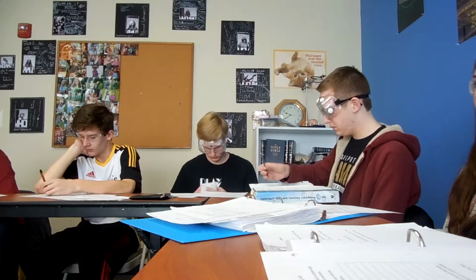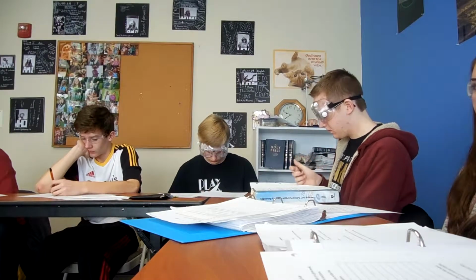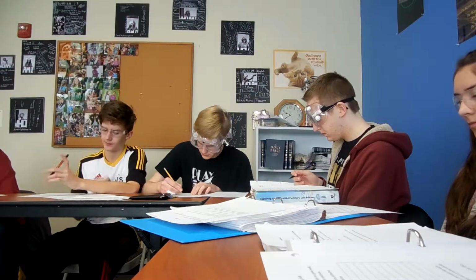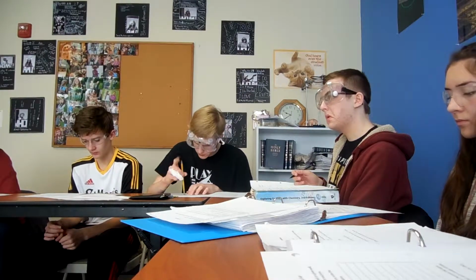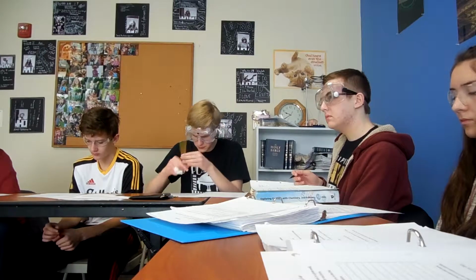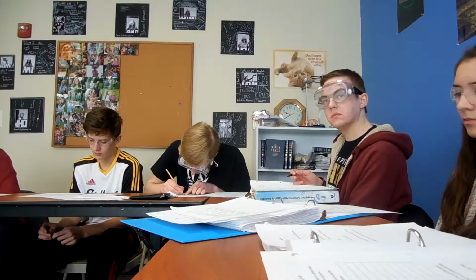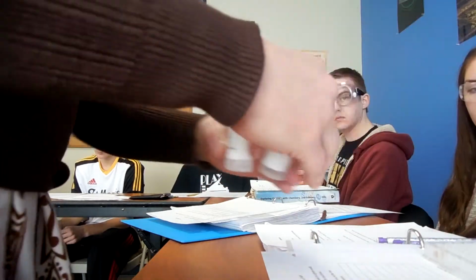So next we're going to mix lead nitrate, which really you're going to want to wash your hands if you get lead nitrate on yourself, and potassium iodide. Okay, so that last one was solid. Yes, we got a precipitate that was copper oxalate. Lead nitrate and potassium iodide. This we already did once. And you guys saw it once before.